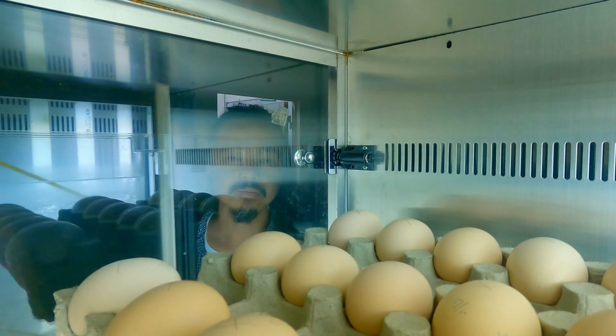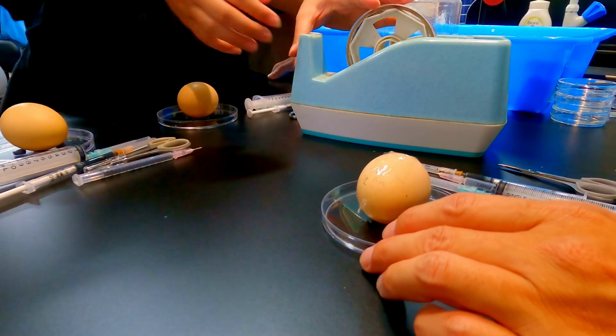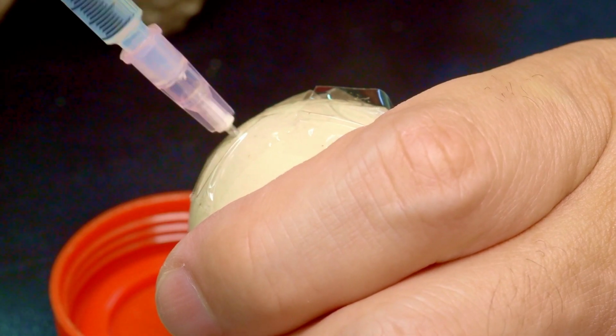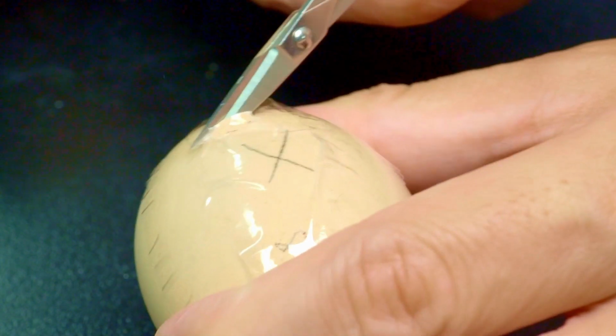Okay, incubation's done, you've got your eggs. Now the really delicate part, getting that tiny embryo out. How do you even start? First step is carefully opening the egg. Then the big obstacle is the albumin, the egg white. It surrounds the embryo and makes it hard to see. Right, it's thick and sticky. Exactly. So you need to remove it carefully.